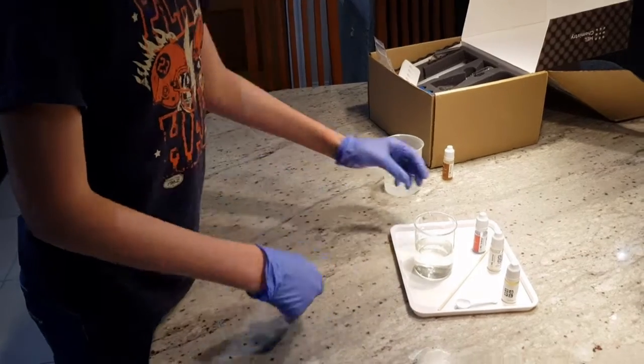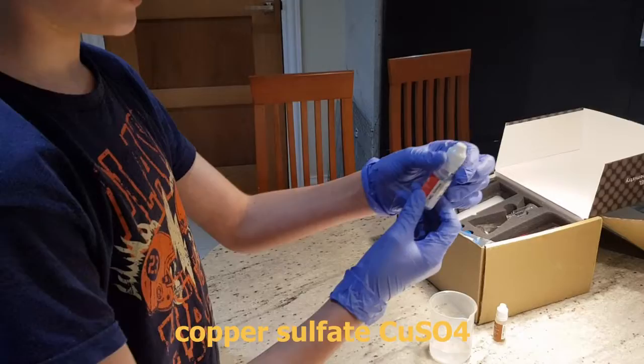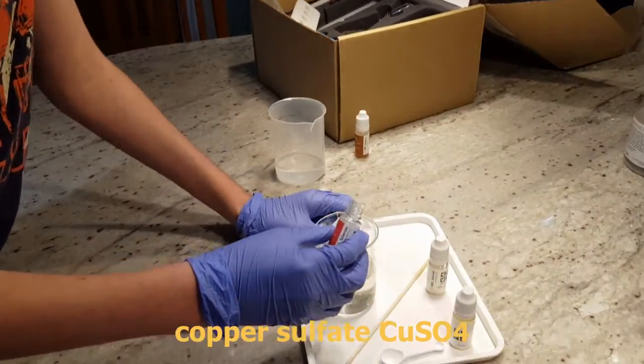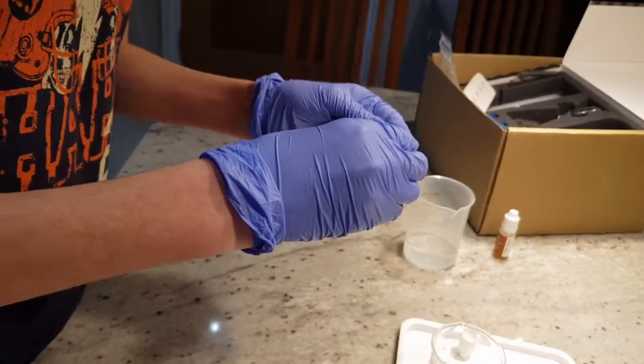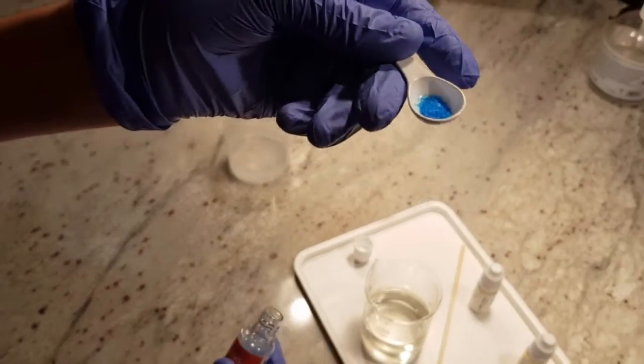Now I'm going to pour various metal compounds or metal salts. This is copper sulfate, which is copper and sulfate combined together. I believe I'm going to use a spoon for this, since it'll be a lot easier. 3 crystals.